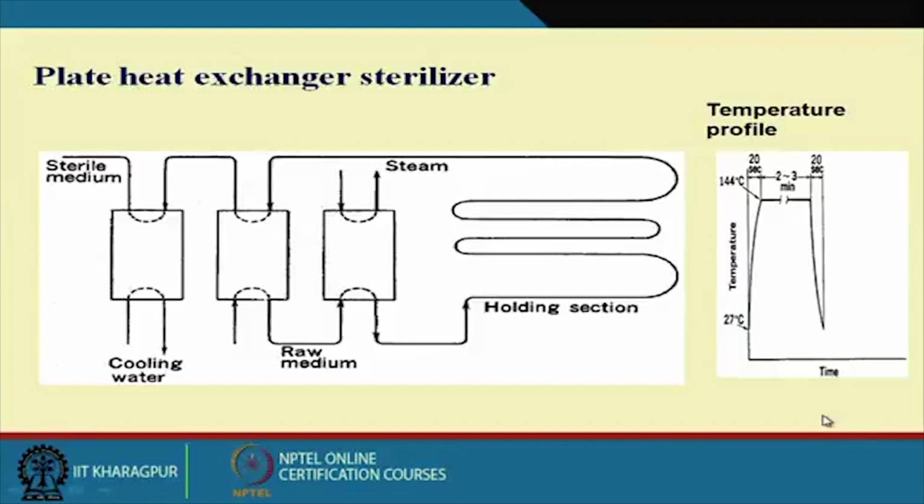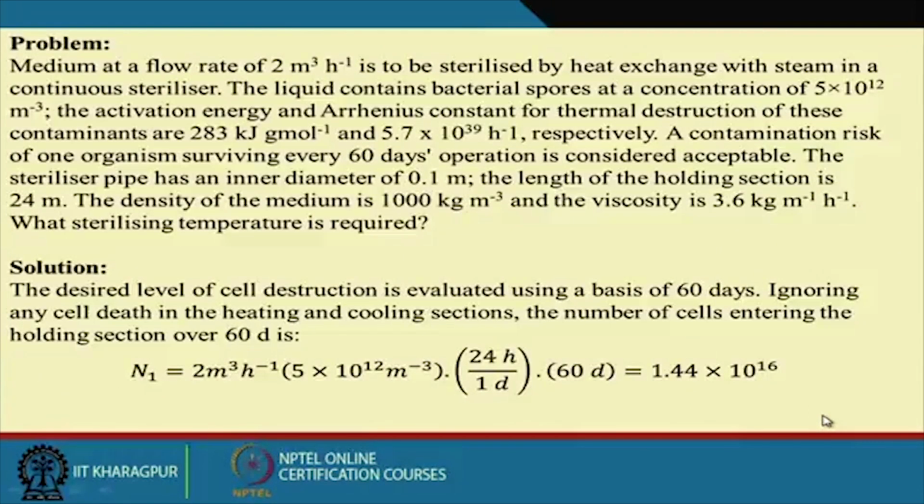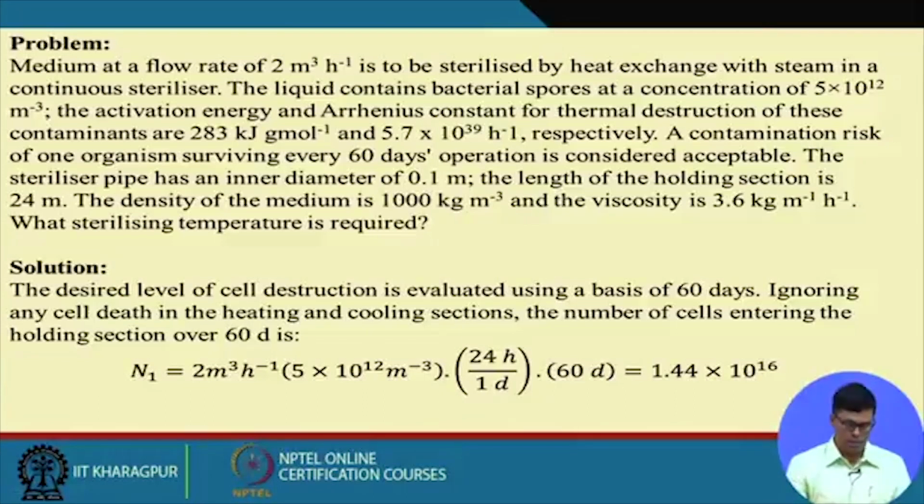Let me discuss some problems related to the medium sterilization process, so that we can have a better understanding of the process.